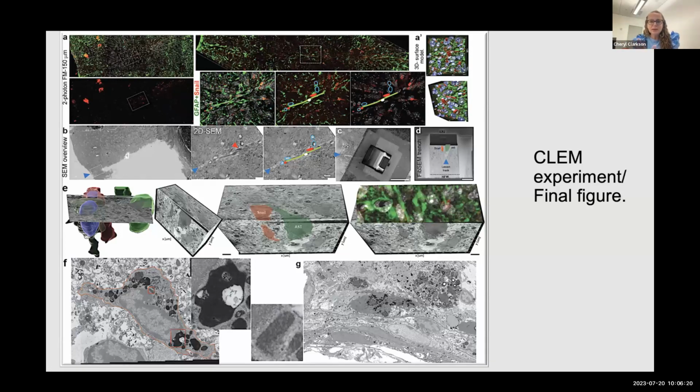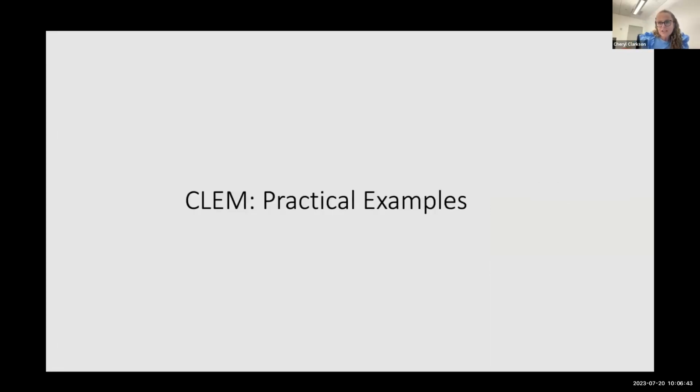So this is the way that I wanted to show all of you, because we are used to working with people to show them how to do 2D, 3D, and after that, how to fuse. But at the end, all that work needs to be translated into a real image that you can show, for example, in a paper. So here I'm just going to show practical examples.